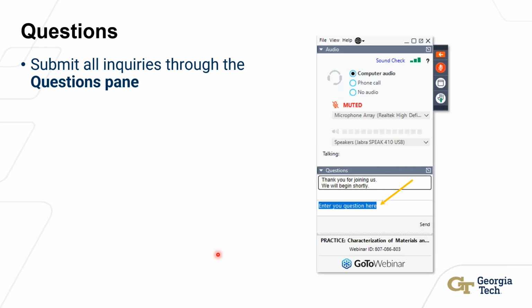Okay. And then how long does it take to process the data? I guess two related questions. How long does it take to do the NLPAR pre-processing? And then how long does it take to do the orientation mapping?